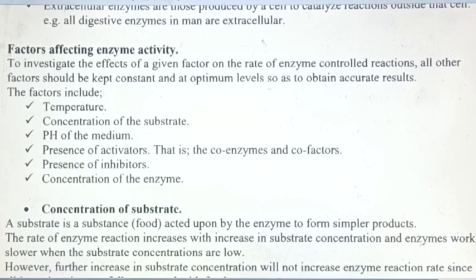Continuation from the videos that we had to look at, on the effect of enzyme activity. Specifically, the video was about the effect of enzyme catalase on the decomposition of hydrogen peroxide.